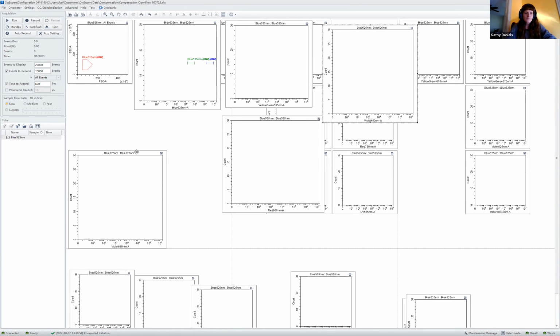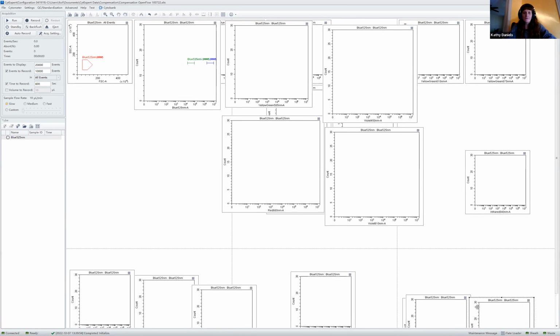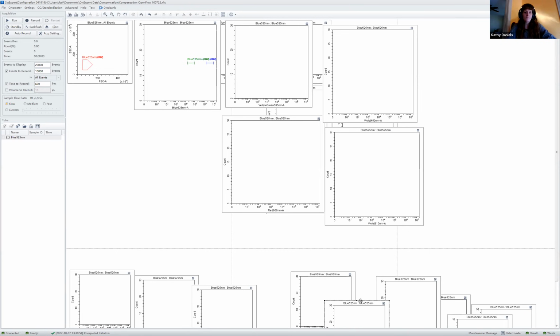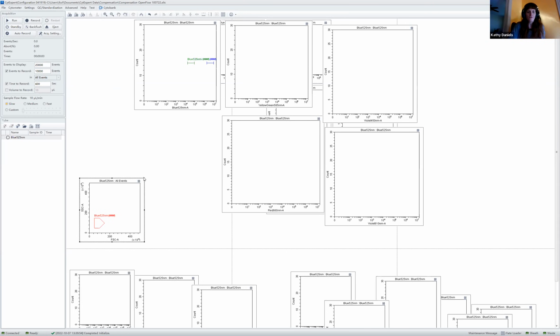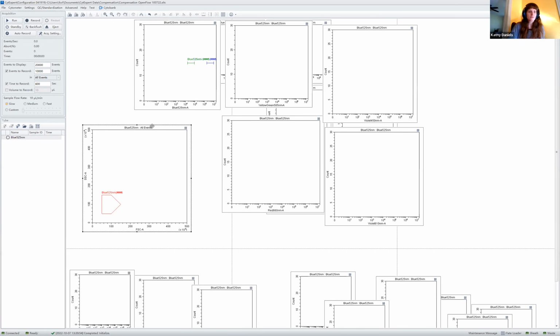Okay. So the ones that are larger are the fluorescent detectors that we're interested in, and the other ones we're not going to worry about because they're not a part of our experiment today. All right. So I went over that we want to start at our slow flow rate, which is going to be 10 microliters per minute. And I change our events to display. And when we need to optimize our forward and side scatter and our fluorescent gains, we're going to use that adjust gain hand. Okay. So now these are all of the dot plots and histograms that I'm interested in.